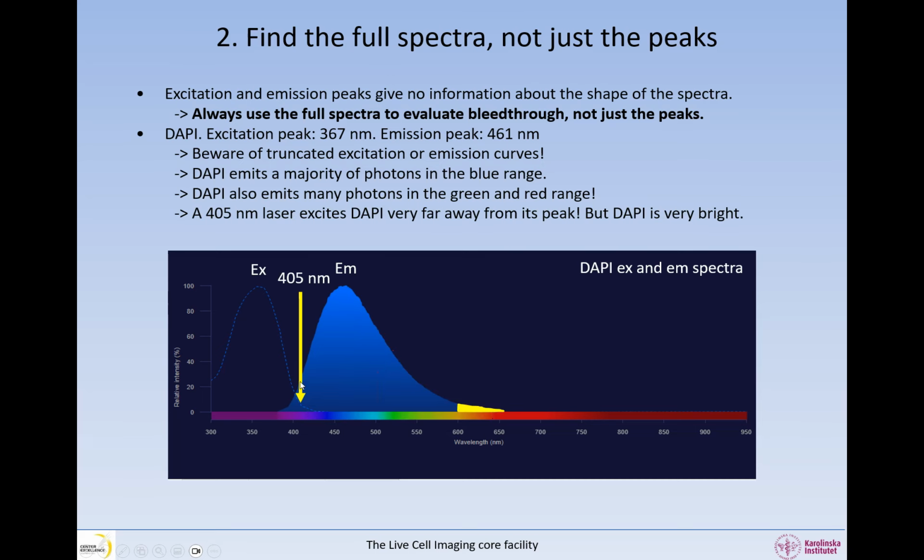You can also see that the 405 laser that we usually use to excite DAPI on laser-based systems is very far away from the peak. But even if we excite it at a few percent, we still see it because it is so bright.